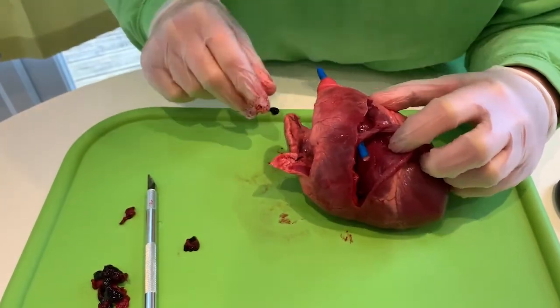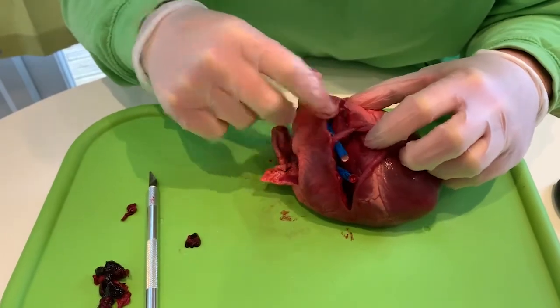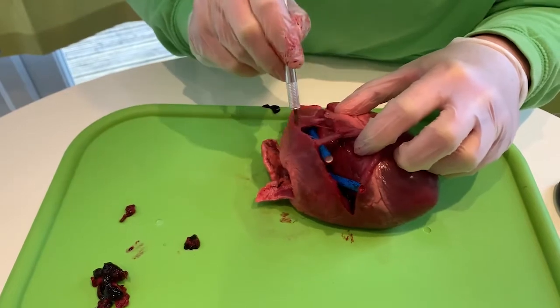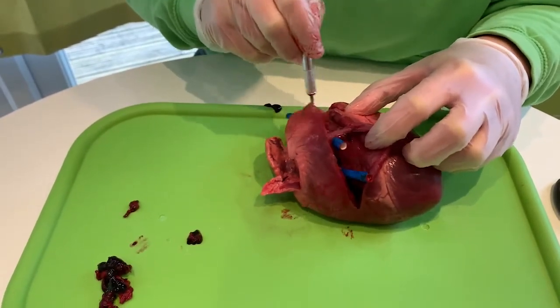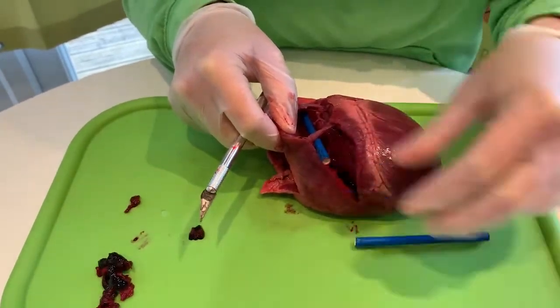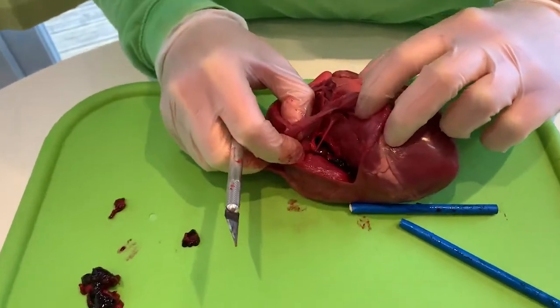So let's see. I think we've got that right, haven't we? Got a blue straw in there and a blue straw in there. Brilliant. So let me cut that a little bit more. Open it right up through that muscle. Okay. So you can see, take those straws out, into the inside of the heart.